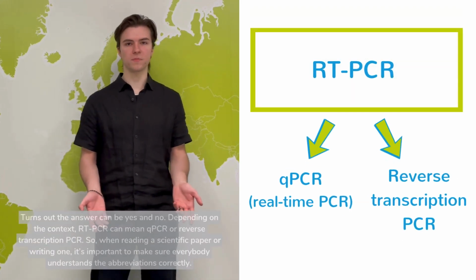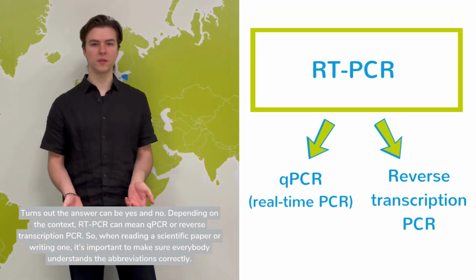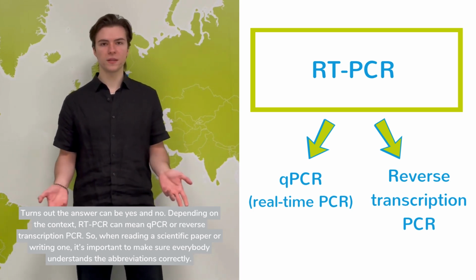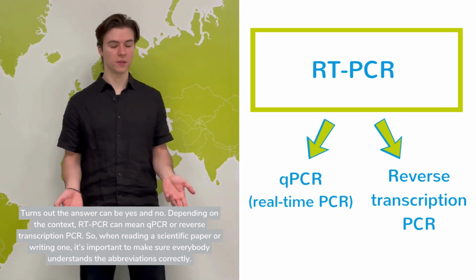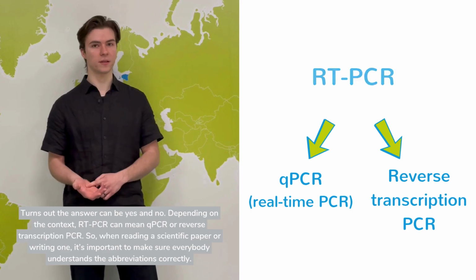Turns out the answer can be yes and no. Depending on the context, RT-PCR can mean qPCR or reverse transcription PCR. So when reading a scientific paper or writing one, it's important to make sure everybody understands the abbreviations correctly.